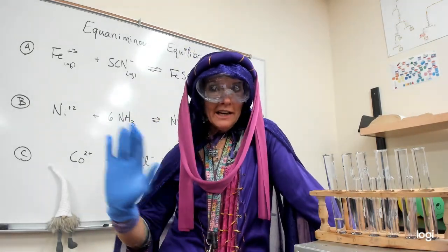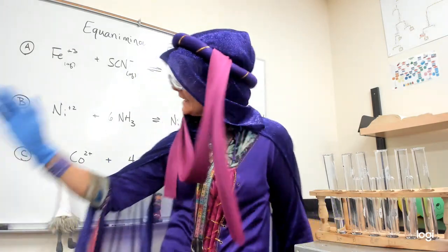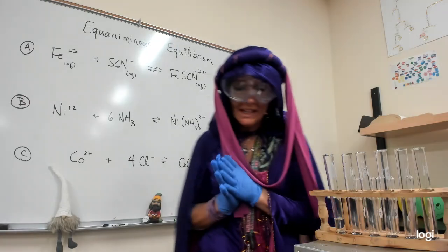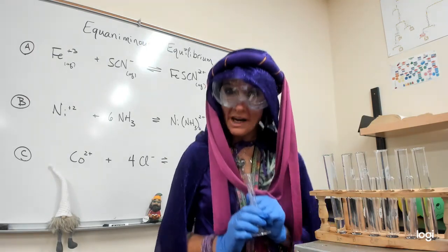To our Equilibrium Lab. It's all about balance. So we're going to study 3 different aqueous equilibriums. AQ just means we're dealing with ions. Everything's soluble. So for our first one, we're going to start by adding water to a test tube.